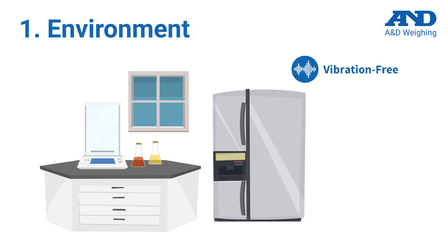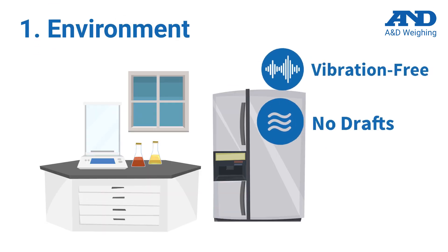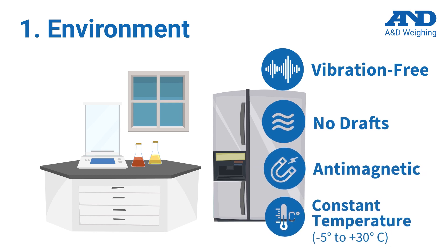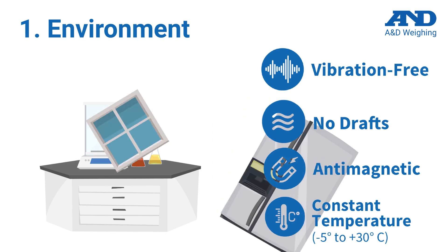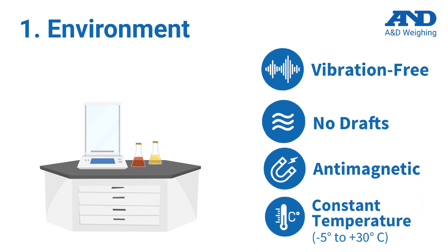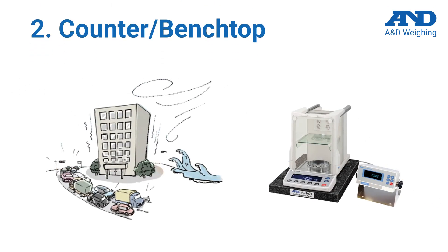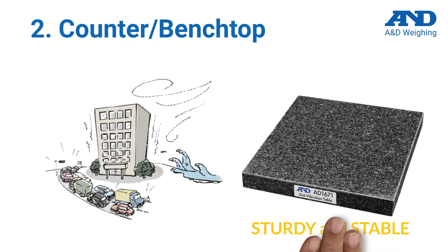The room should be vibration-free, with no drafts or electrostatic charges, and maintain a constant temperature. Weighing results vary widely when exposed to significant changes in room temperature. Be sure to stay away from windows and refrigerators. The weighing bench should be sturdy and stable.